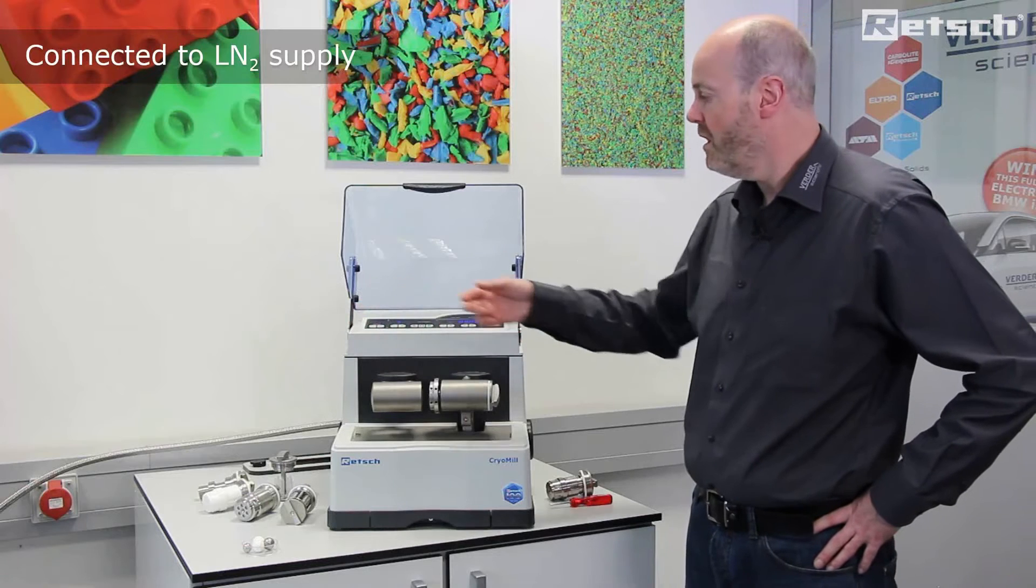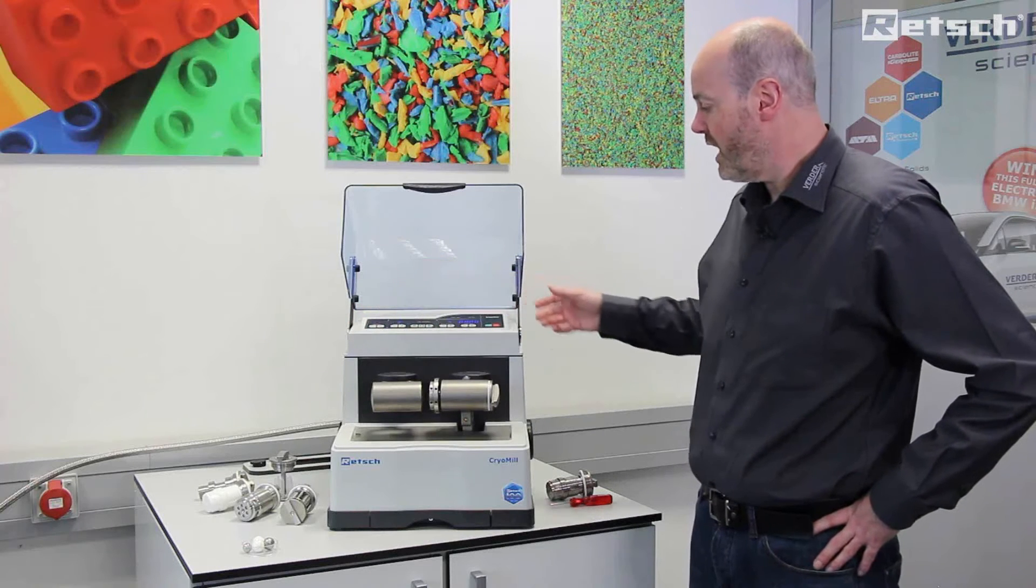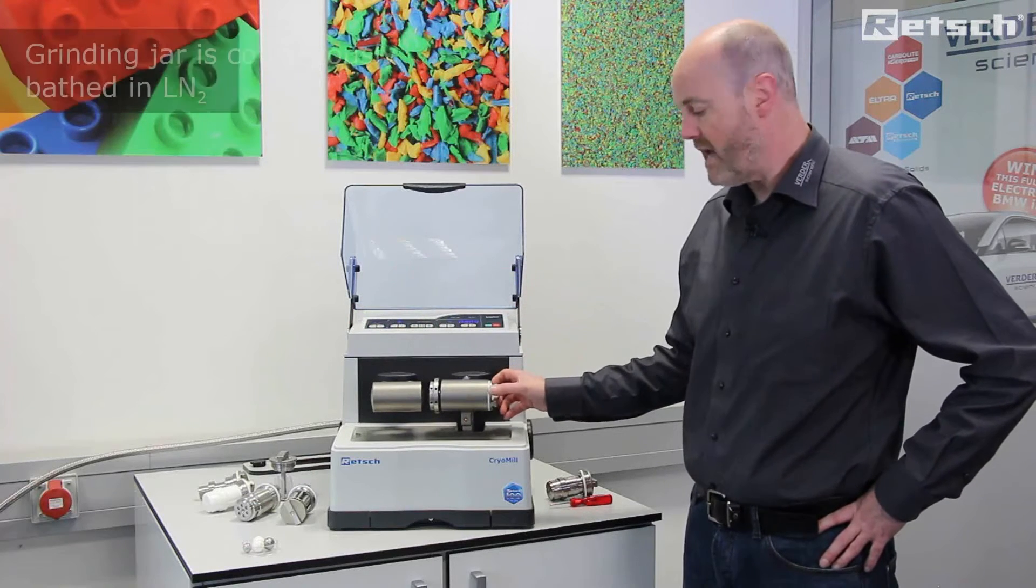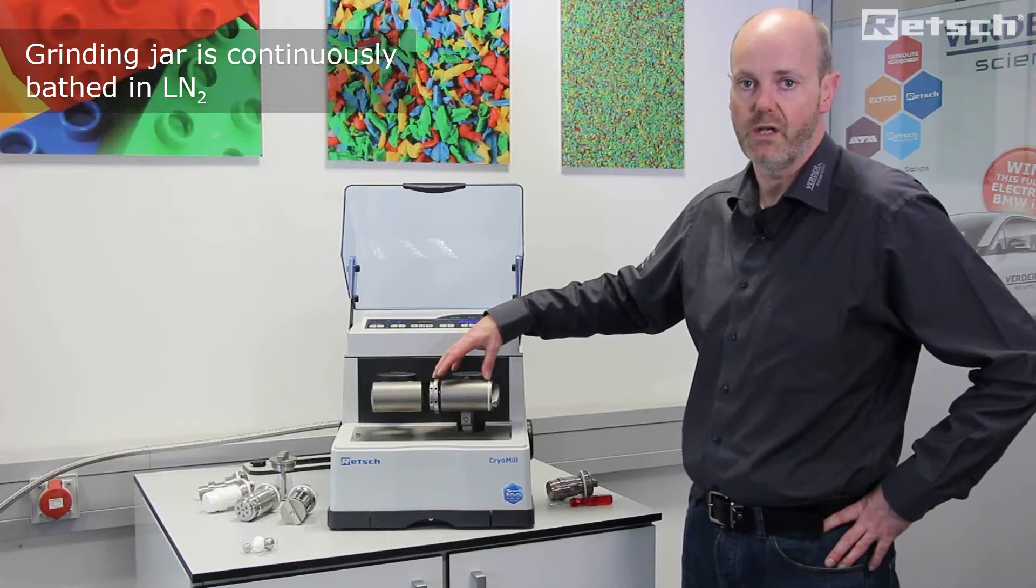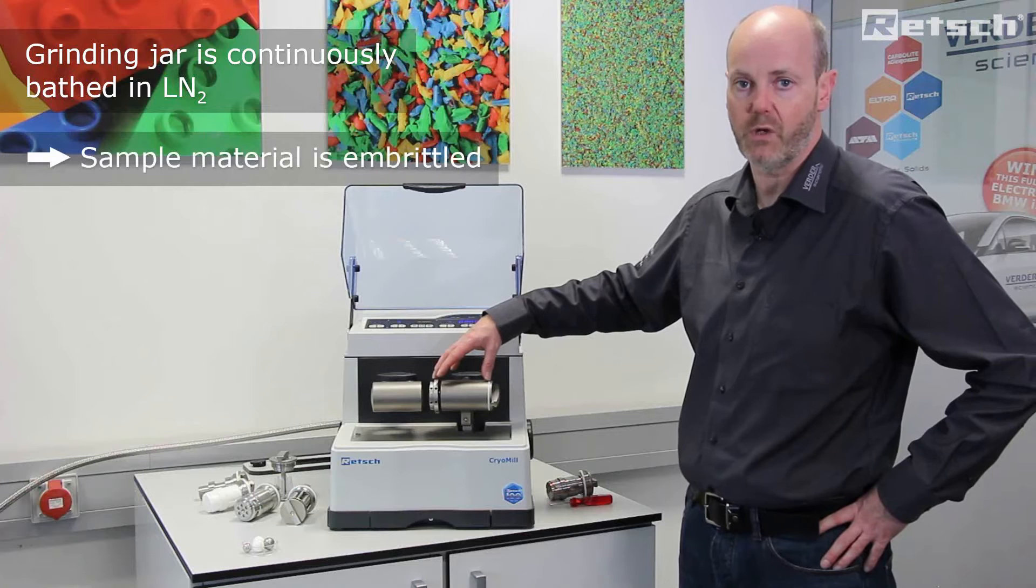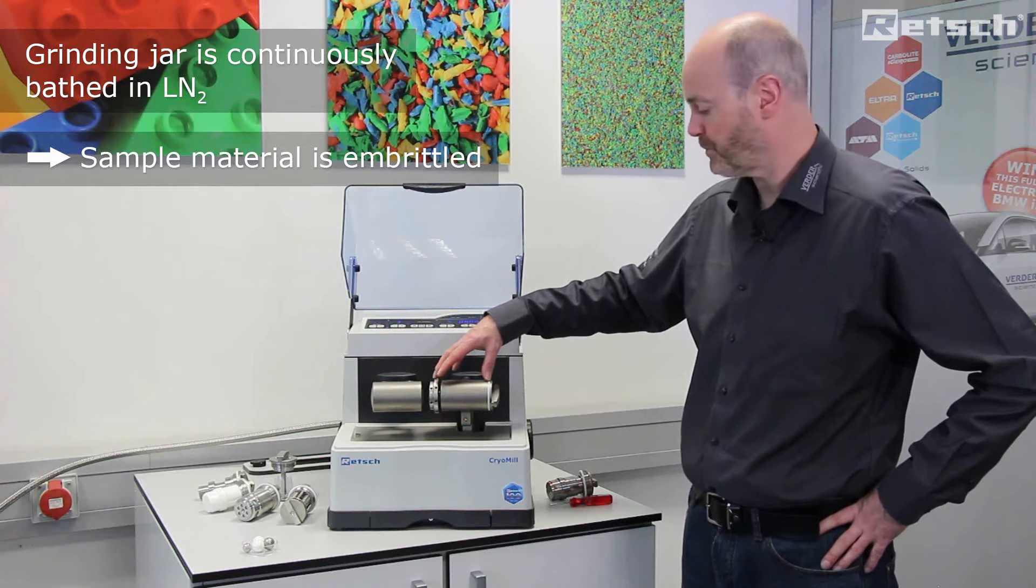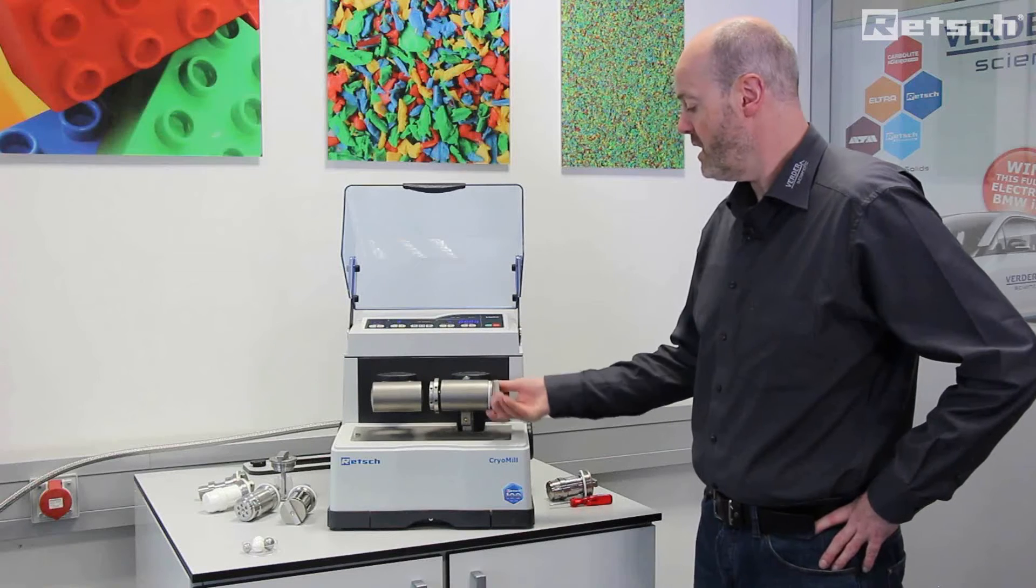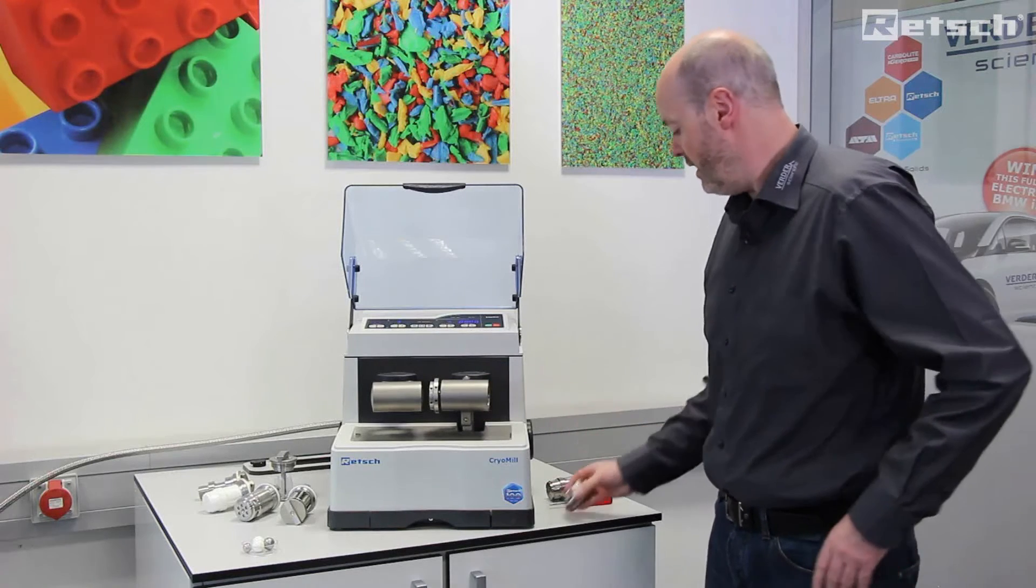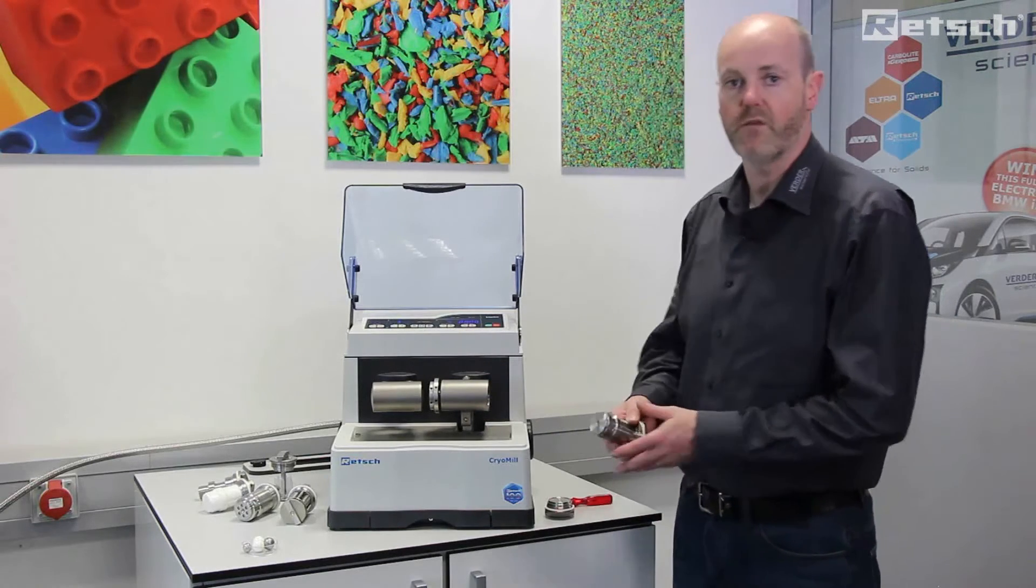The liquid nitrogen circulates around the instrument and bathes the grinding jar continuously in liquid nitrogen, thus embrittling the sample material and keeping it cold. The modus operandi of the CryoMill is identical to that of the mixer mill.